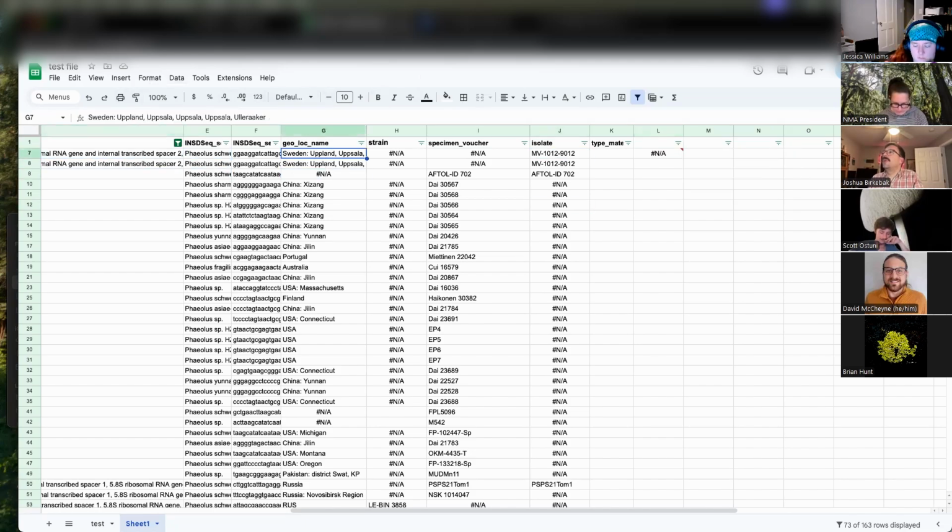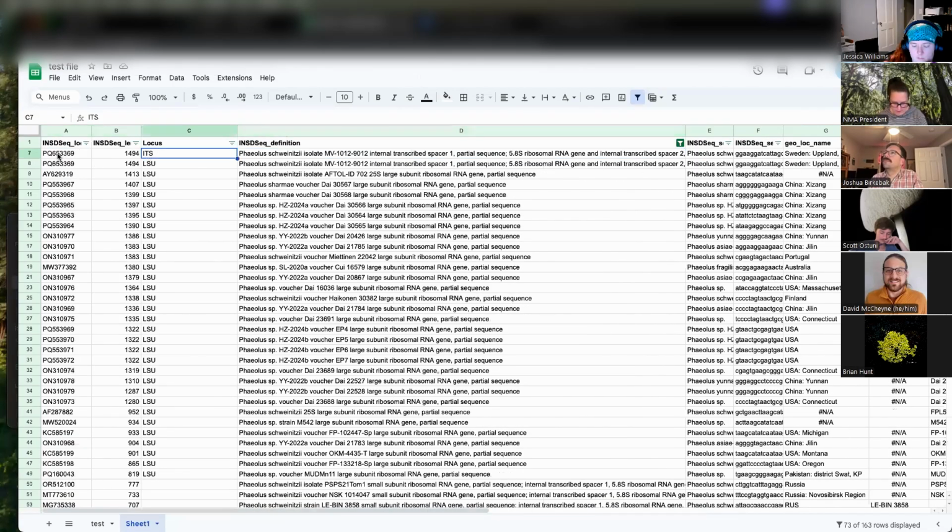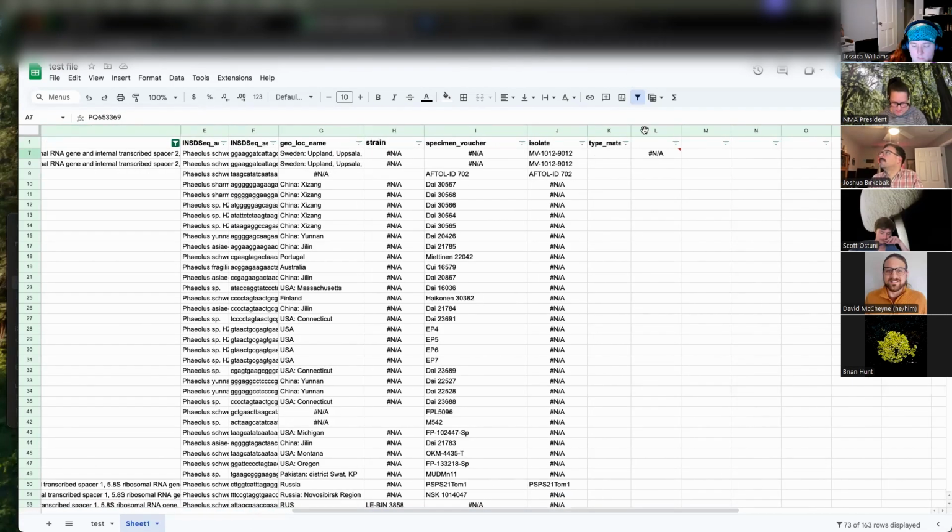I don't know what I'm doing wrong here. Well, it would work. We could debug it if we wanted to, but does that make sense? At least what I am doing.